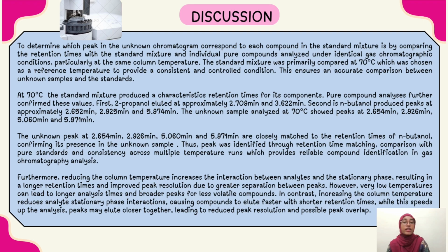The unknown sample analyzed at 70 degrees Celsius showed peaks at 2.654 minutes, 2.926 minutes, 5.060 minutes, and 5.971 minutes. The value of the unknown peak, like I just mentioned before, closely matches the retention time of N-butanol, confirming its presence in the unknown sample.